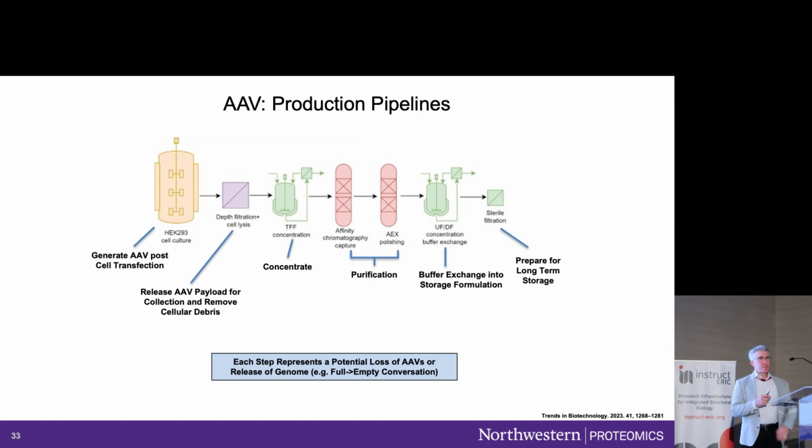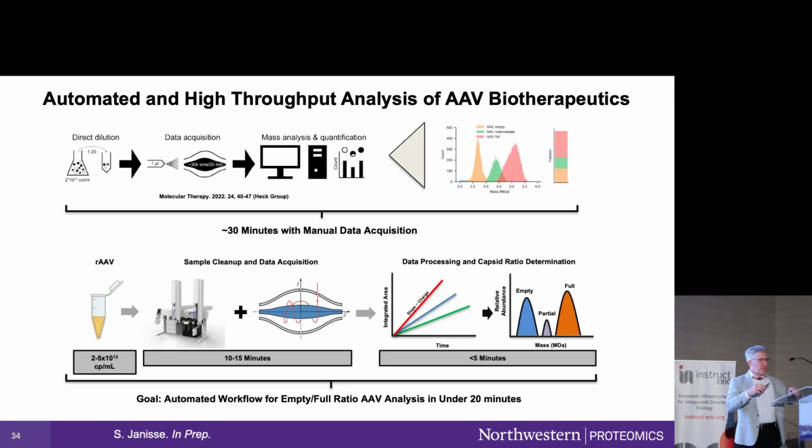Of course, preparing AAVs is non-trivial, and then making sure that you characterize your biotherapeutic, also non-trivial. So there's many steps involved in the processing of AAVs, and this is more of an engineering type project. What you do now, if you want to use native mass spectrometry on an AAV, you take your sample, maybe there's 10 to the 10 or 10 to the 11 particles in there, and you spray it, you electrospray it into the gas phase, and you're running with these little manual needles. So this is the nanospray, basically a 10 micron little hole, electrosprayed manually. It's very detail-oriented work, it's all manual, and there's some state of data analysis tools.